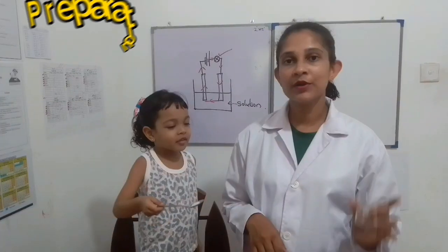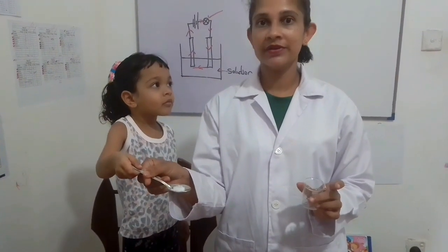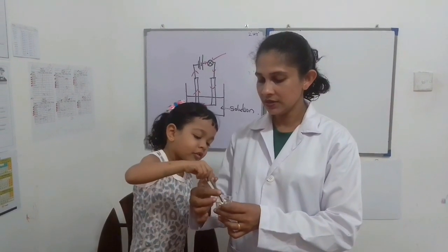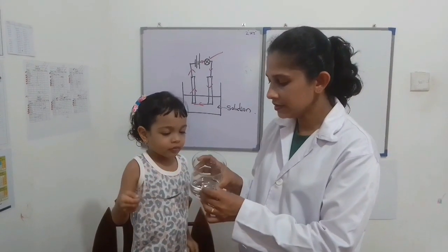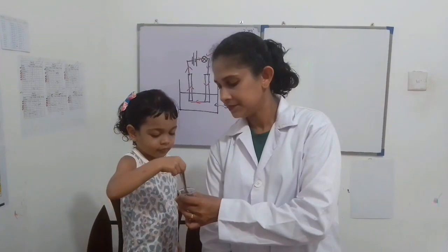We are going to prepare sodium chloride solution by dissolving this sodium chloride. This is the common salt we use in day-to-day life. We dissolve this salt in water to prepare sodium chloride solution.